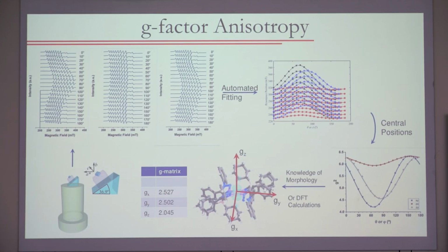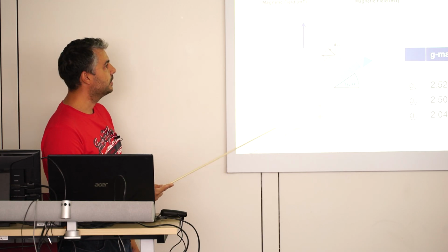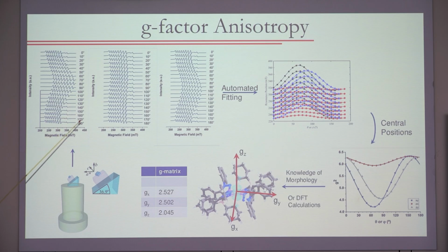So now some actual examples. This is just an example, again a paper from Jesse. I put this because it's one of my favorite papers that I was able to work on. We did single crystal EPR. We did several experiments, and she did many more, and other people did more.